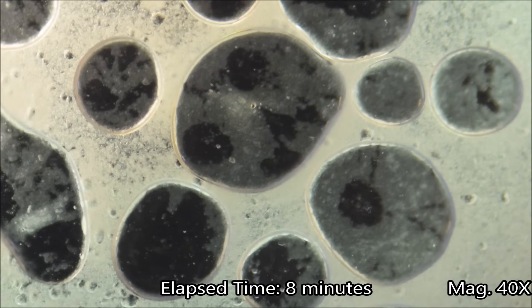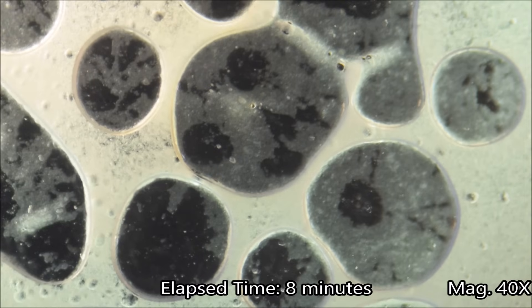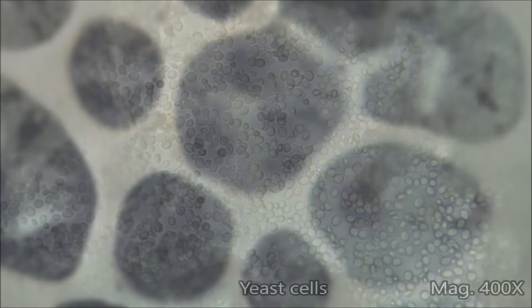There are millions of tiny yeast cells on this slide, consuming carbohydrates and producing carbon dioxide which eventually forms bubbles.